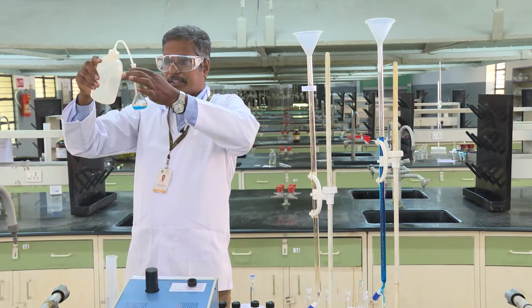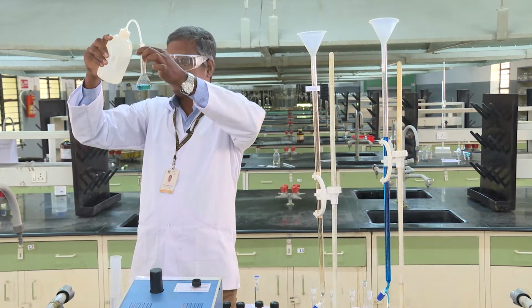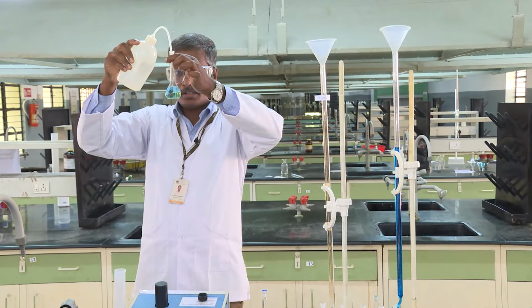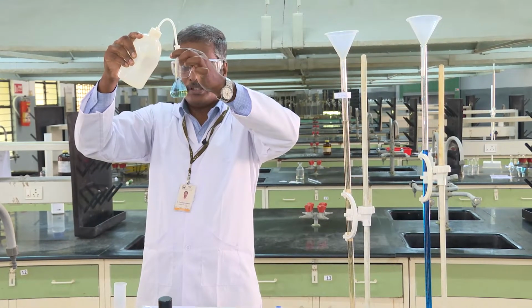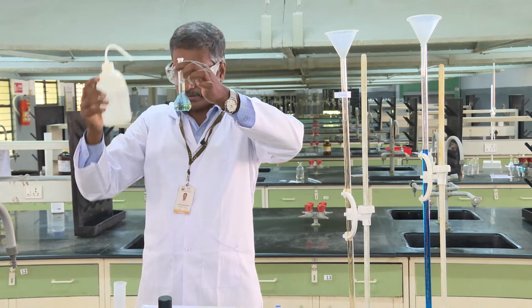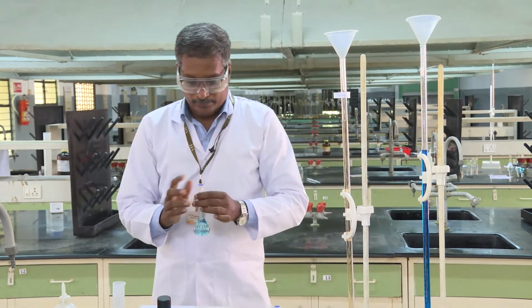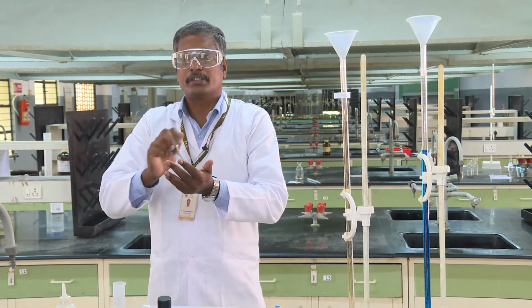Or instead of that we can make it up. That's perfect. It should be the lower meniscus. You should do it a bit carefully when you are closing this, and then you can shake this first sample so that the solution is homogeneous.